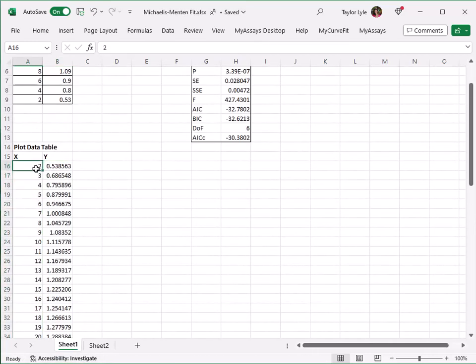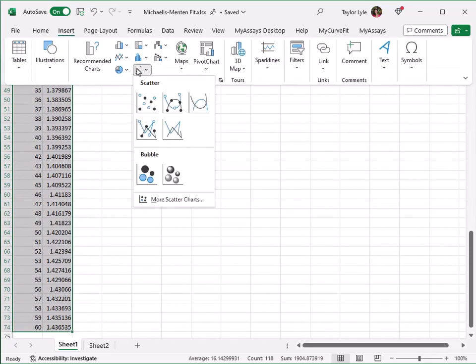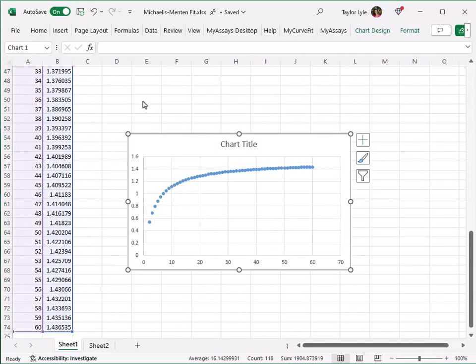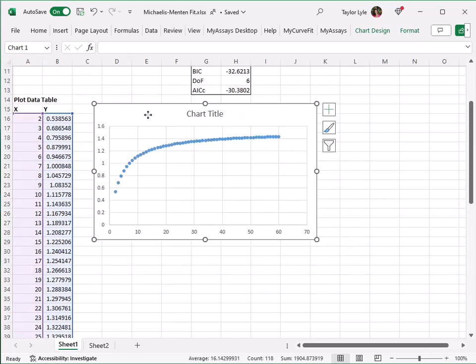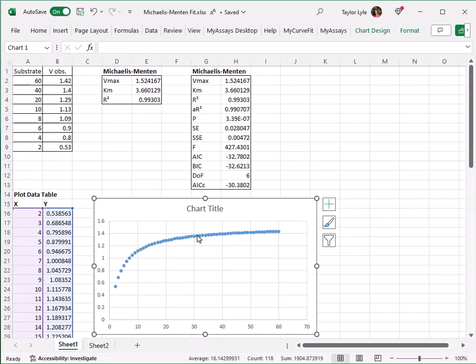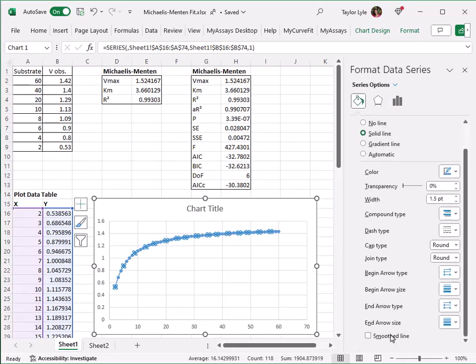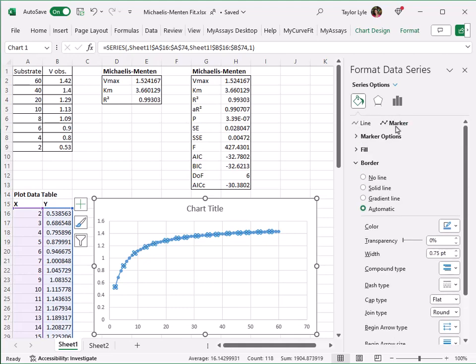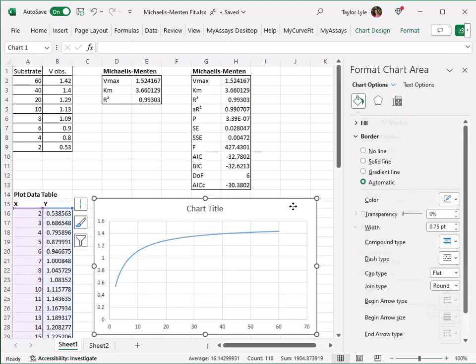Next, I'll highlight the calibrator X and Y values and select to insert a scatter plot. I'll move this chart up to the top of my sheet to simplify viewing my result information. Next, I'll select to format the data series to add a solid, smooth line and remove the markers. Now on our chart, we can see the curve fit line.